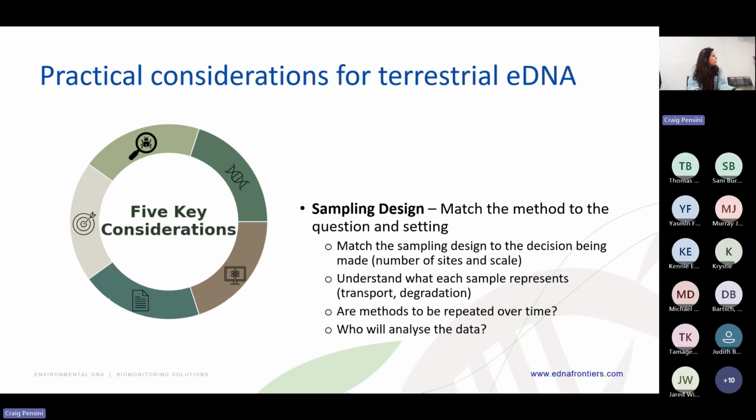Other things that we need to think about is, are the methods going to be repeated over time? And if they are, who is analyzing the data? Is it the same person or different people? Is the method that I'm using today a good method because it has been validated and taught, or is it because I liked the idea, and is it going to be a good idea to be repeated in the future?